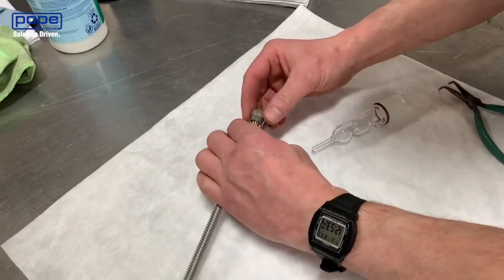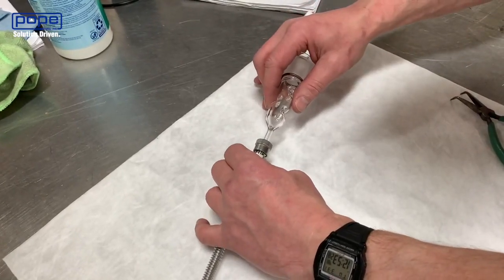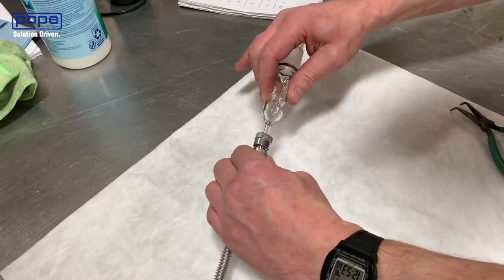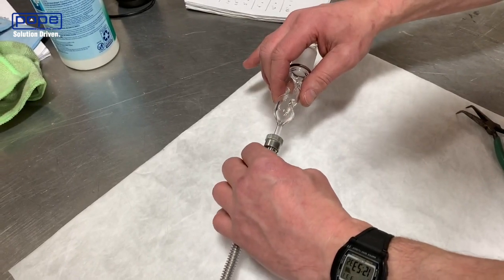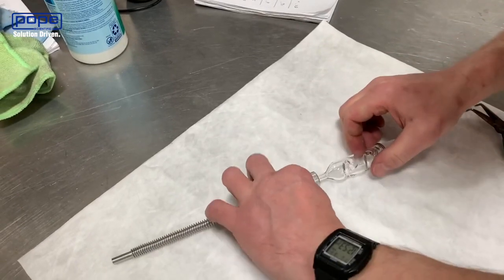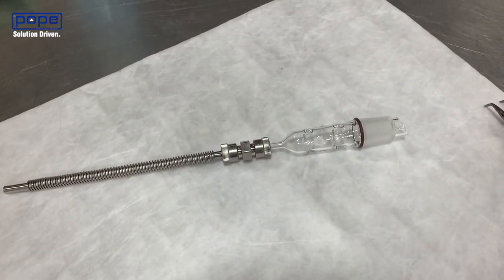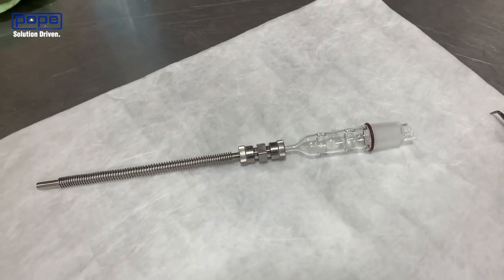Now switch over to the glass side. Again, make sure that fitting is loose so the glass can slide in easily. You hear that little pop — that means it's inserted fully. Feel a little bit of resistance, then pop it in the rest of the way. Tighten that fitting down — both fittings are just going to go hand tight. No reason to use a wrench on them.